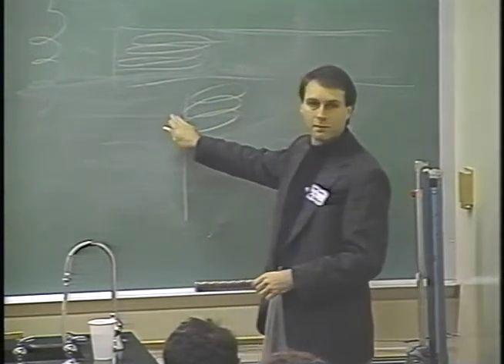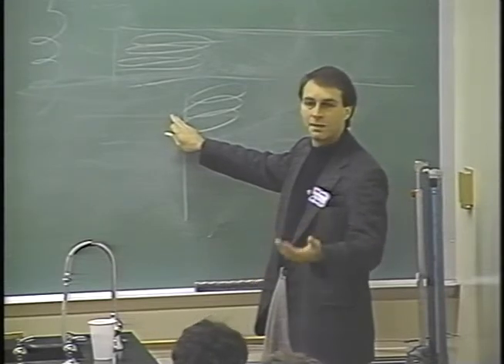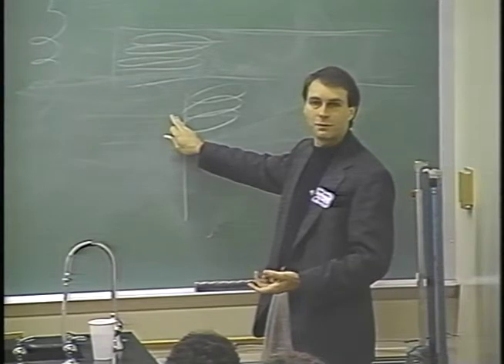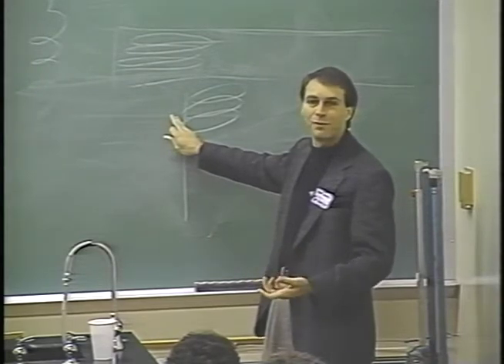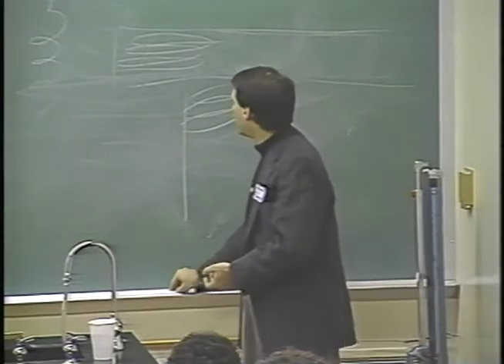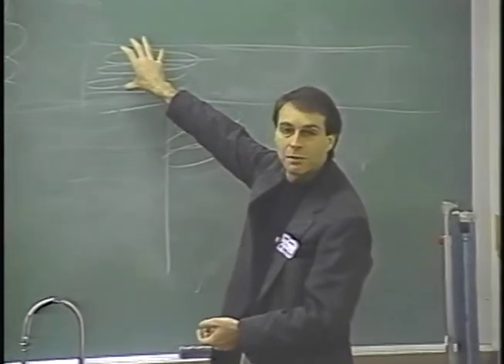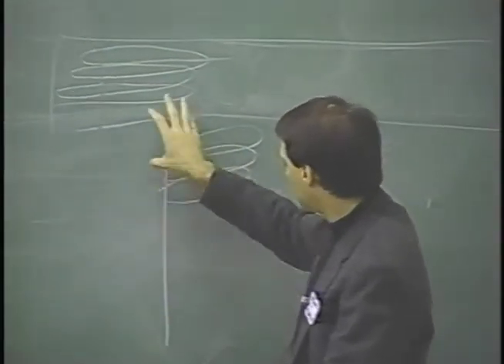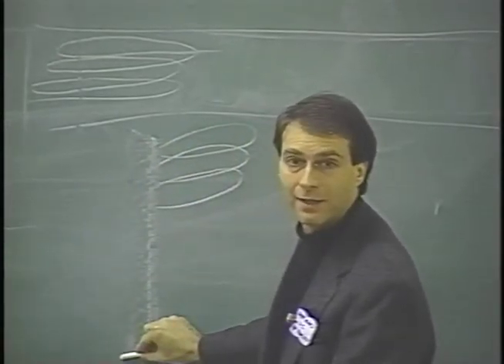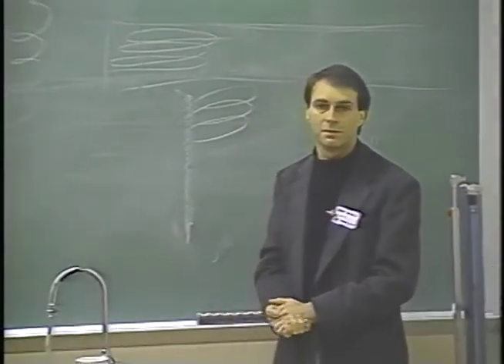You don't see this kind of central idea with loops hanging off of that. We can see that when we mistreat our chromosomes by going into inappropriate buffers, and we can see even in the light microscope that there's a transition from the way the chromosomes look in vivo to what's happened with these buffers. So what we think is happening is that these things are exploding, becoming unwound. Then you end up with a mass of tangles down the center, and things just hanging off because there's no longer any self-association of those bits of chromatin.